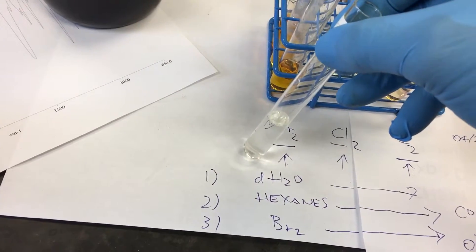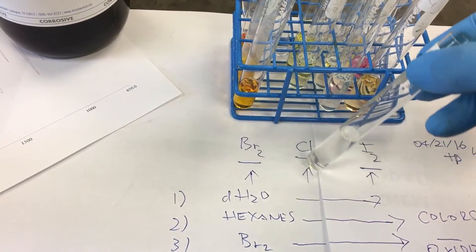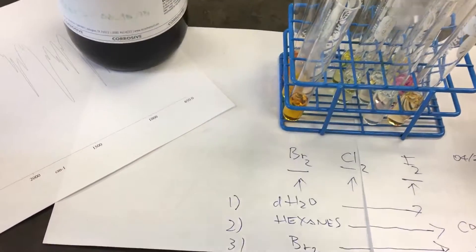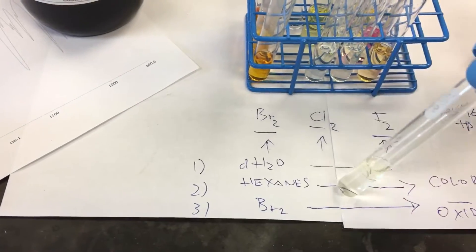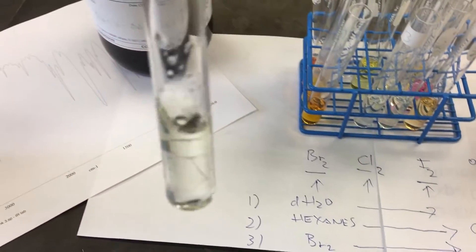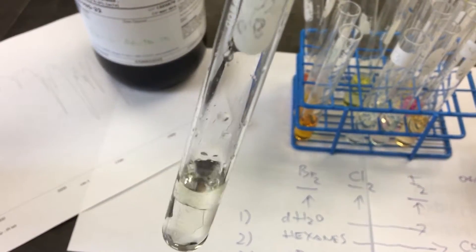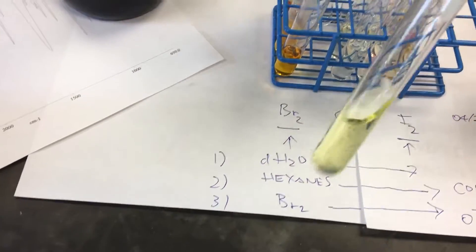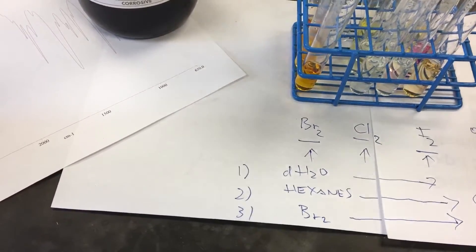Let's see. So this one, deionized water with chlorine, clear. One hexane with chlorine, yellow too then, right? Do you see the top layer? It's yellow. Alrighty.